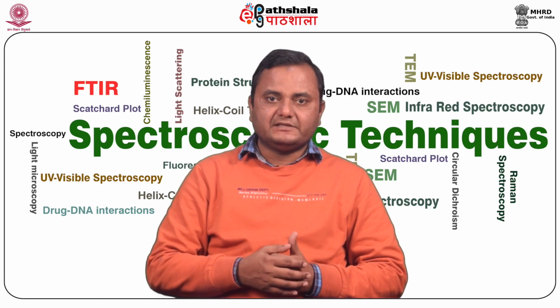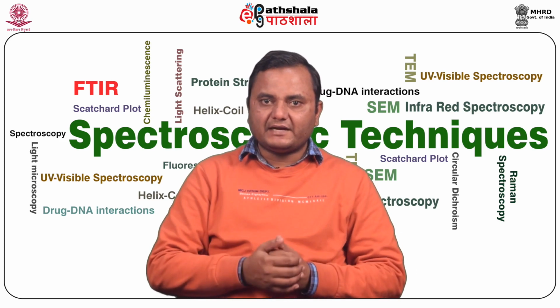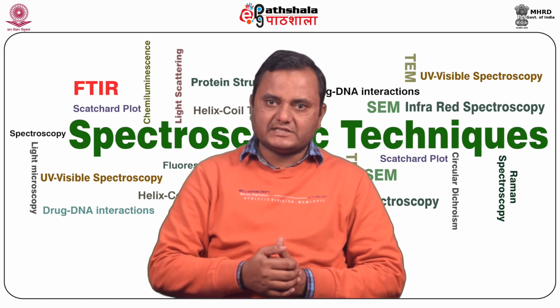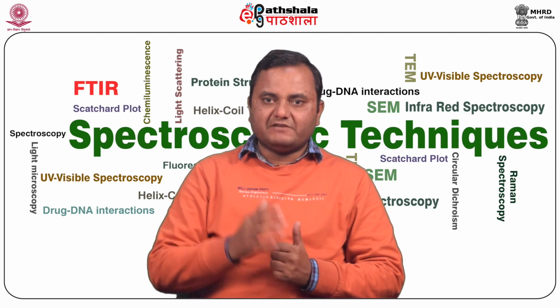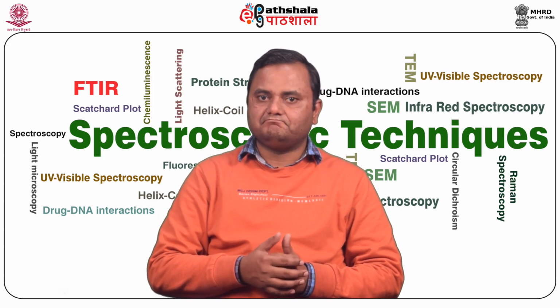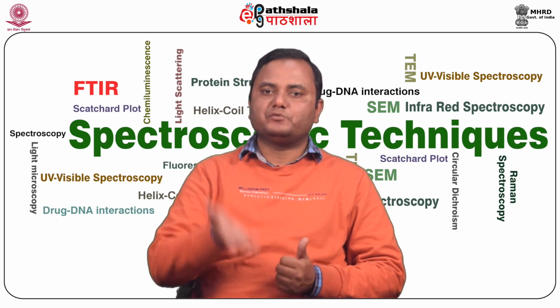Contaminants, especially unfolded protein, peptide, and particulate matter that act as scattering particles, anything that adds significant noise or artifacts in the signal or contribution to the CD must be avoided. Filtering the solution with a 0.2 micron syringe filter is good enough to reduce the noise and improve the signal.